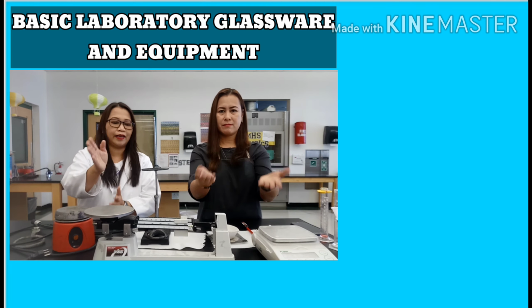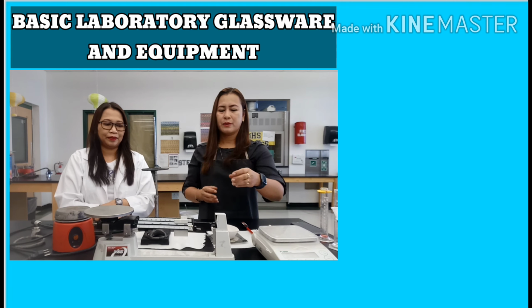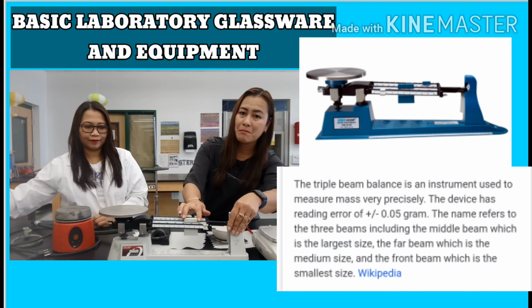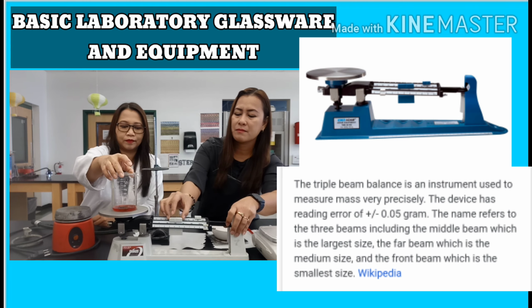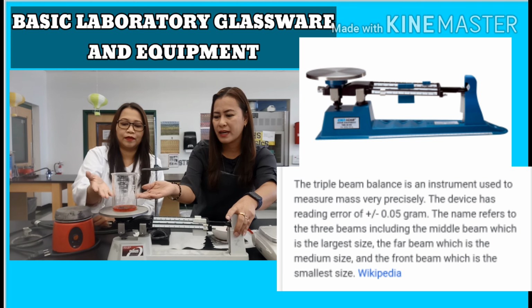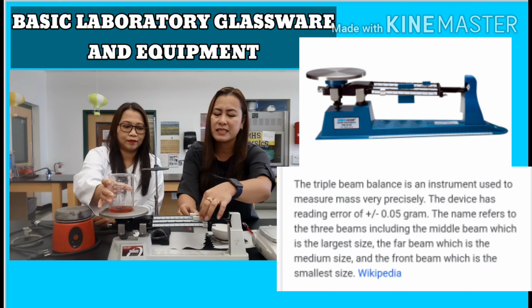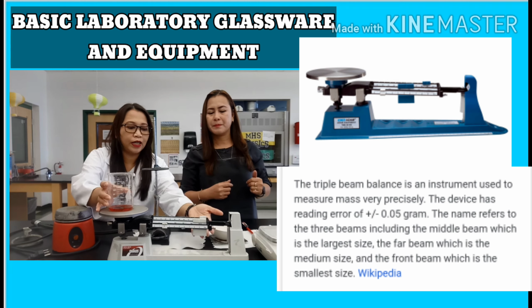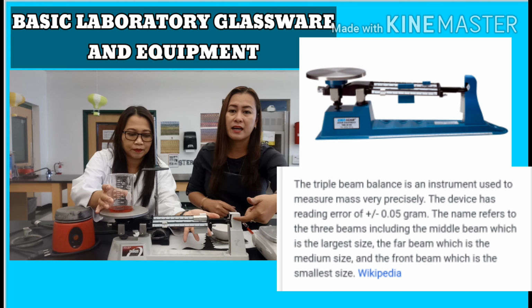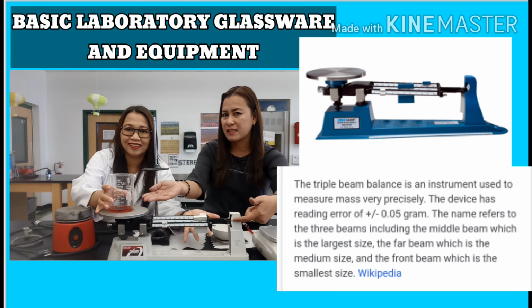And last, we have the triple beam balance and then the digital balance. We have the balances. Now, let's have the triple beam balance. This is a one pan balance over here with the triple beam. These are your masses. You're going to calibrate your masses depending on the measurement or the weight of the object on the side. So you're just going to have to move from tens to hundreds and to ones gram. And once it goes like this, we make sure that the pointer is pointed at the middle. That means that you have the equivalent balance of the masses on the other side.